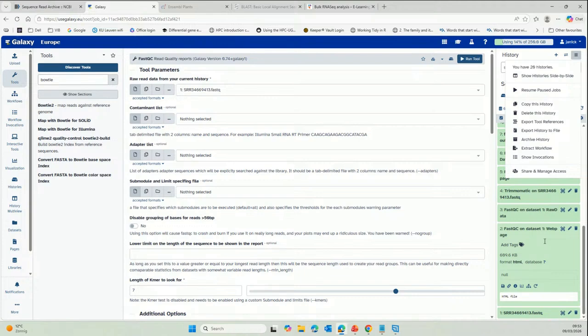Now, but my data and your data might be very different. You might not have a stranded experiment. You might have paired end data. You might have another organism. So this is why I'm not sharing workflows with you, because your parameter settings will be different than mine. We will go over the workflow step by step, because again, for your data, you might need to use different settings than I'm using for this data set.